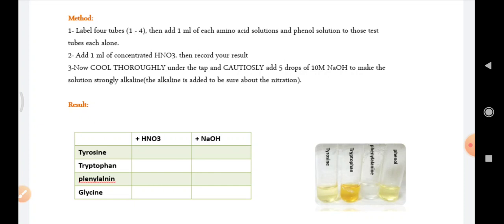Now, cool thoroughly under the tap and add 5 drops of 10 molar NaOH to make the solution strongly alkaline. The alkaline is added to be sure about the nitration.